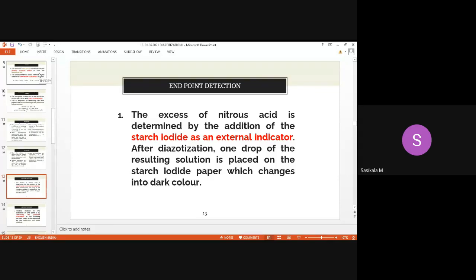First, you are taking a conical flask. Just imagine the conical flask, as I couldn't find any animation or diagrammatic representation for diazotization titration. That's why I'm explaining orally. Just understand from the theory itself. Once you perform it in the lab, then we can understand how the reaction takes place. You will definitely be performing this before your exam.